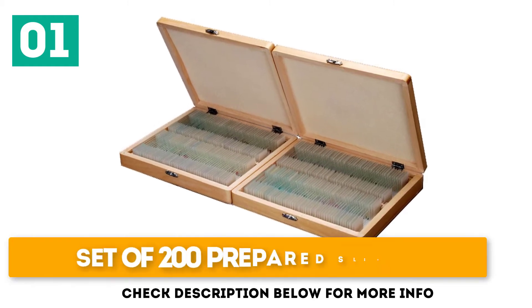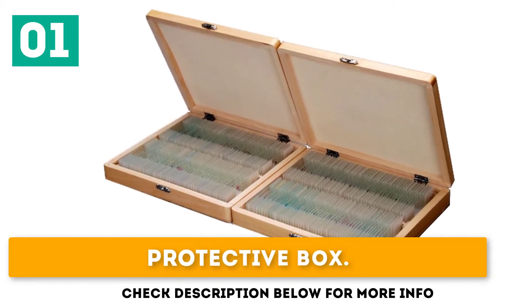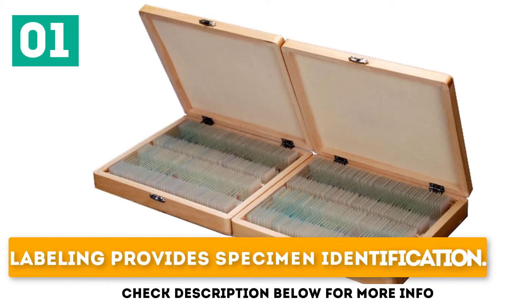Key features: Set of 200 prepared slides, protective wooden box, and labeling that provides specimen identification.